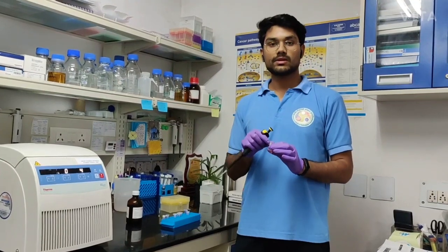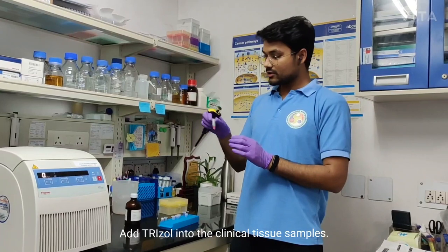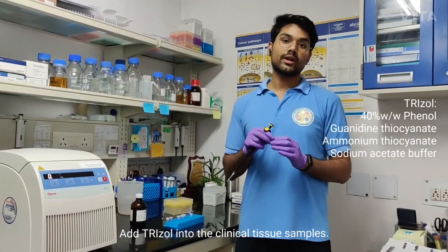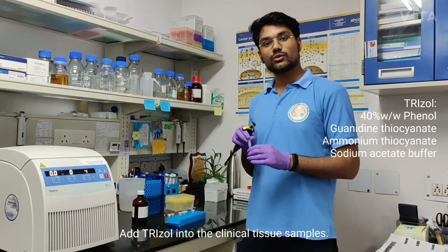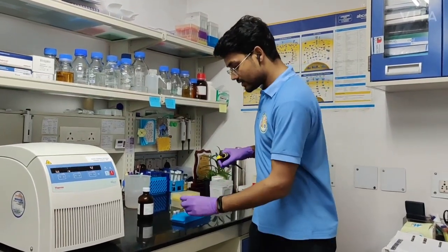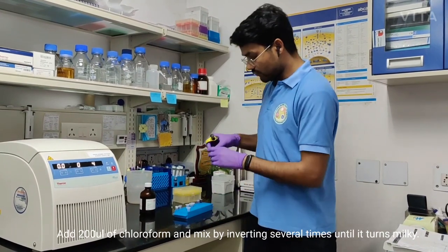Hello everyone, in this video I will be discussing how to isolate RNA from the clinical samples. So first step is to add the TRIzol in the samples. This TRIzol that I have already added contains phenol, guanidine thiocyanate, ammonium thiocyanate and sodium acetate buffer. After the addition of TRIzol, we will add 200 microliters of chloroform.